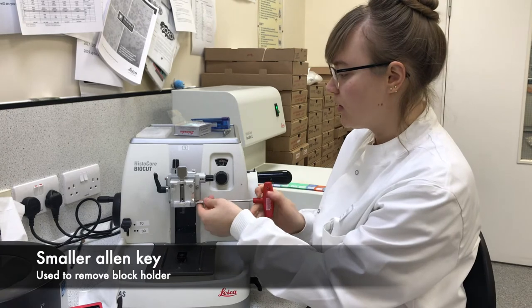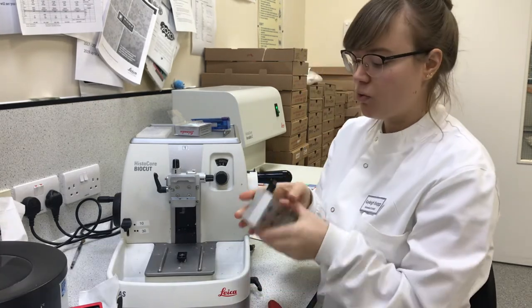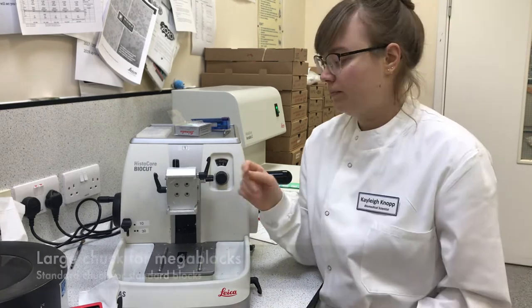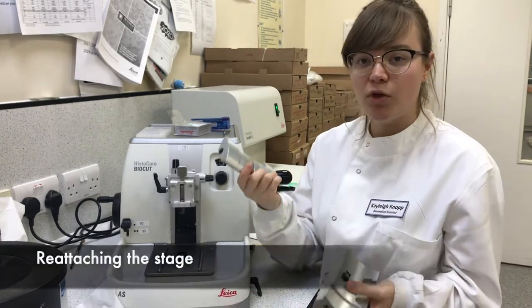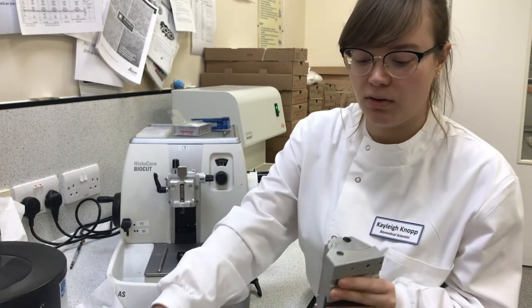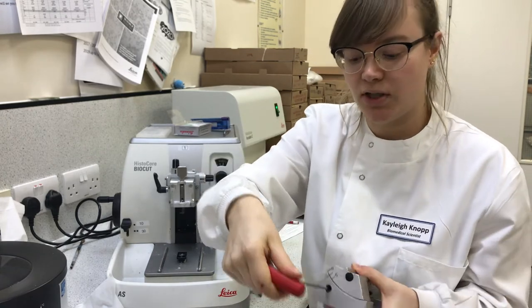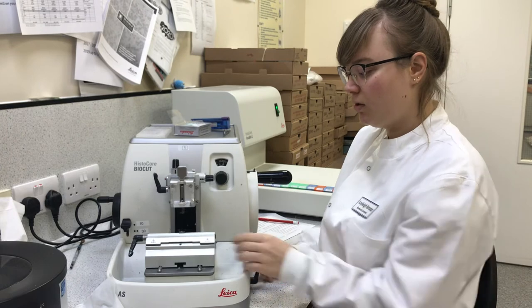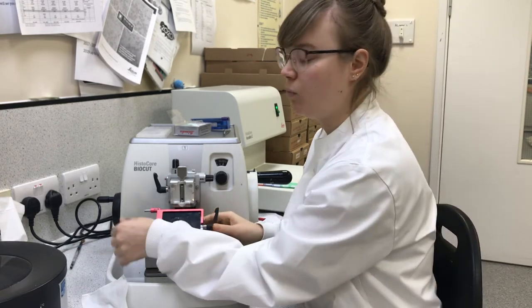This tool can also be used to loosen the nut here, which slides the block holder off. This is useful for cleaning, but also useful to place the mega block chuck. This is for larger blocks, while the standard chuck is for smaller blocks. We've cleaned this to keep our microtome running smoothly — lock it with the line in the middle, make sure it doesn't move, slide that back on, and use this lock to lock it in place.